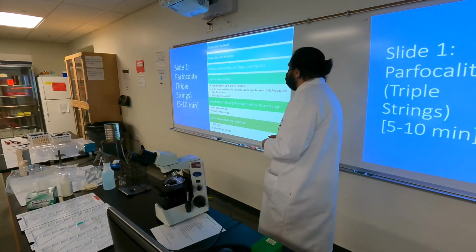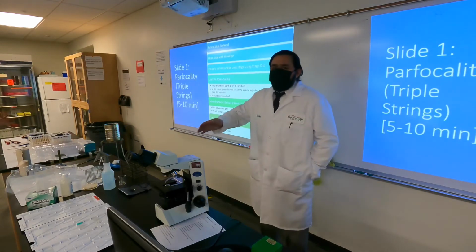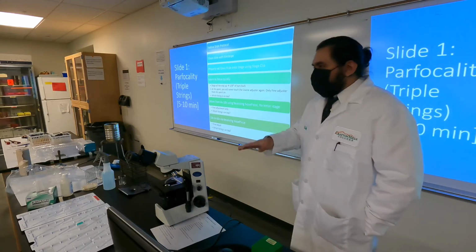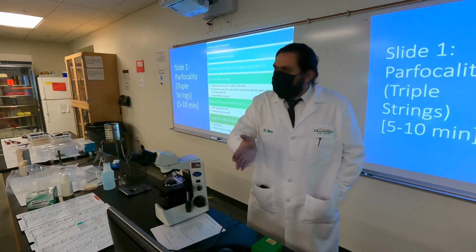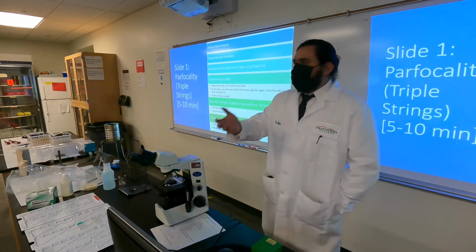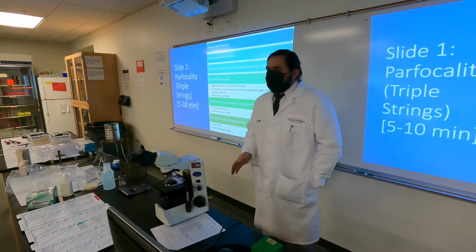So only under the 4x objective that we have set up right now, we'll set it up and look for the triple string slide. From there, we'll now step from the red to the yellow objective, which will be our 10x, or our 100 total magnification. Take a picture from that state, then move on from the yellow to the blue one, which is going to be from the 10x to the 40x objective, or 400 total magnification. Take another picture there too, and then that's it. We'll go back in reverse and we'll be done with this slide.